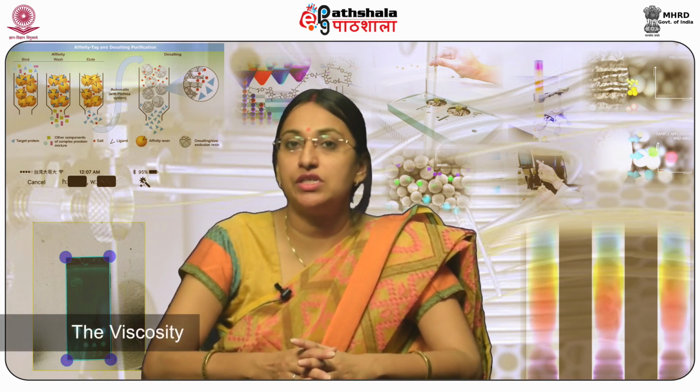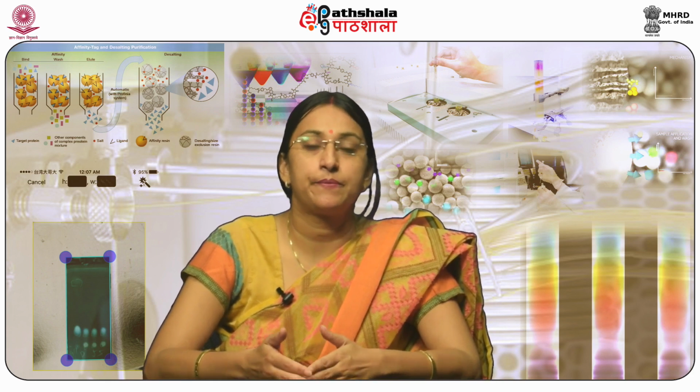However, in a gradient elution, the mobile phase composition is required to change over the course of chromatographic run. Also, the viscosity of the mobile phase may change due to change in its composition, and the pressure may be required to be adjusted to maintain the required volumetric flow rate. The pump that delivers the mobile phase can also be used to mix or blend the solvents.